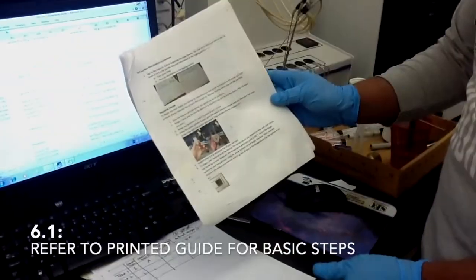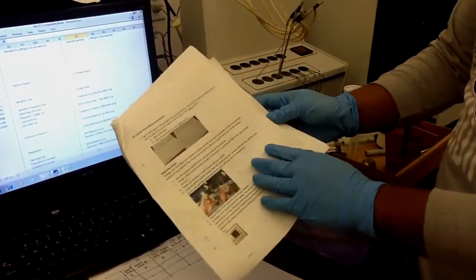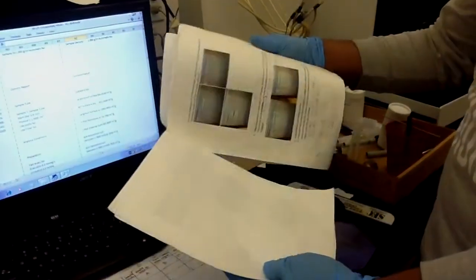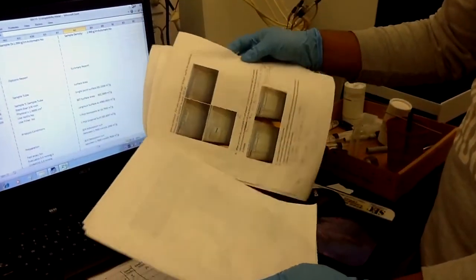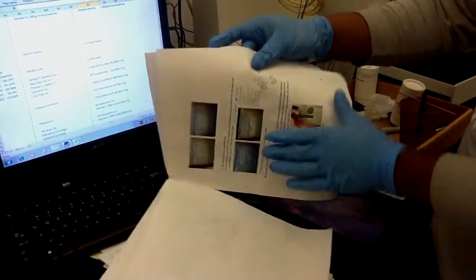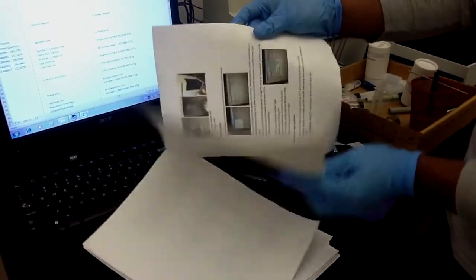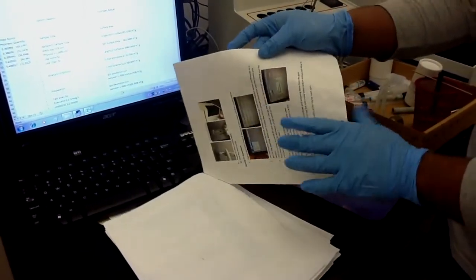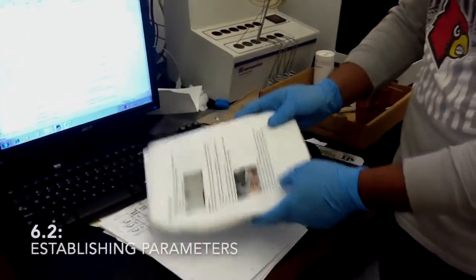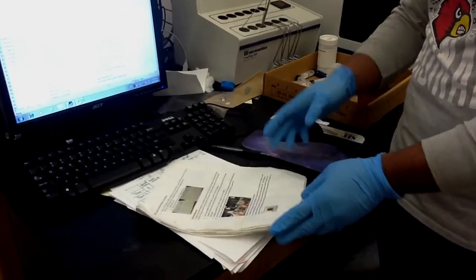There is also one methodology, like a procedure file, from the beginning to the end. So if someone has difficulty, they can also use this method file. It also shows step by step how to set up the program and how to set up the tube in this machine, from the beginning to the end. And I also put all of the parameters here, but it also depends on your material.